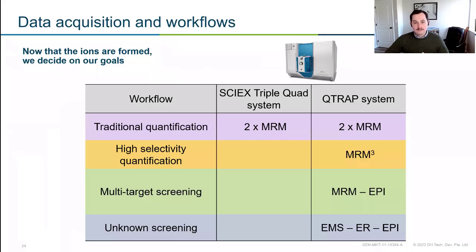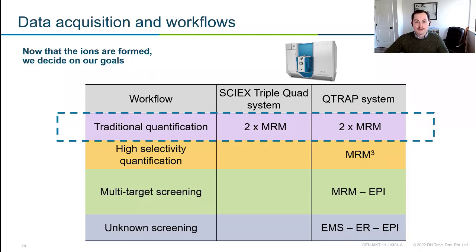So that's just a brief background, but let's talk about the questions that we can answer, because that's the most exciting part about mass spectrometry, at least to me. So we've got our ions. Let's do our first workflow. Maybe we want to do just some traditional quantification. Regardless of whether you have a triple quad or a Q-trap, this experiment is going to work the exact same. You wouldn't notice that you used a Q-trap over a triple quad unless you looked in the metadata or peeked over at your instrument and saw a badge on it that said Q-trap.